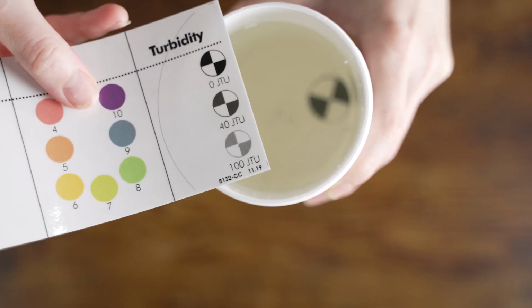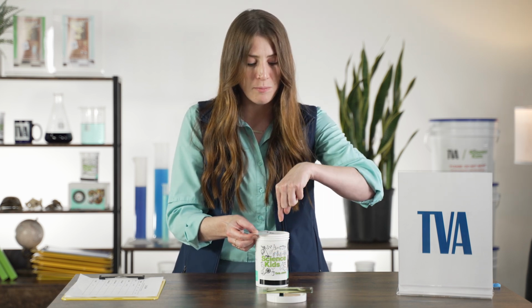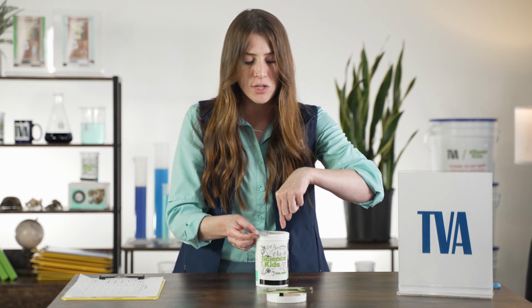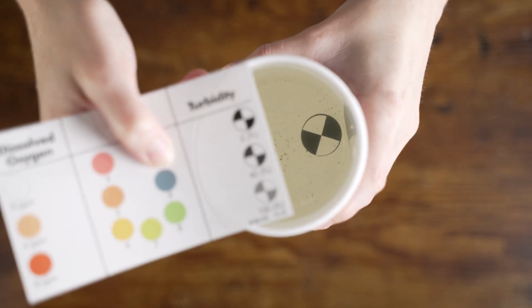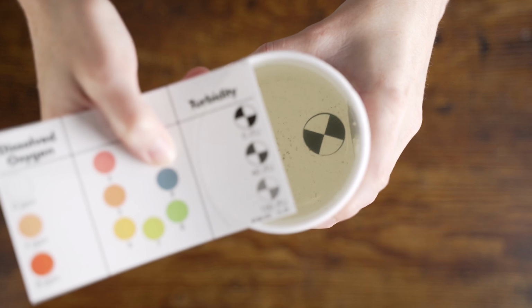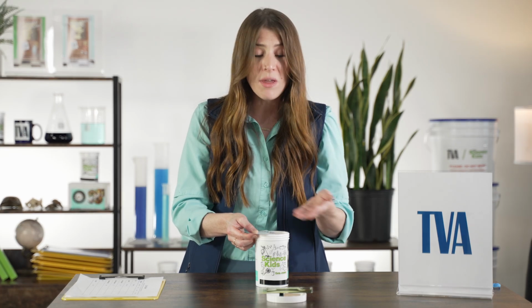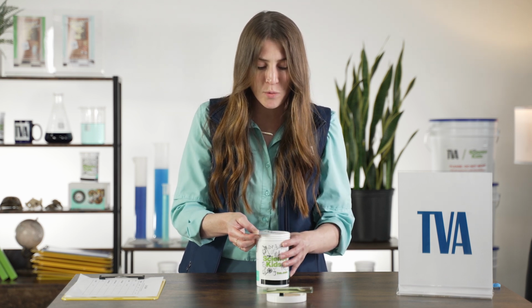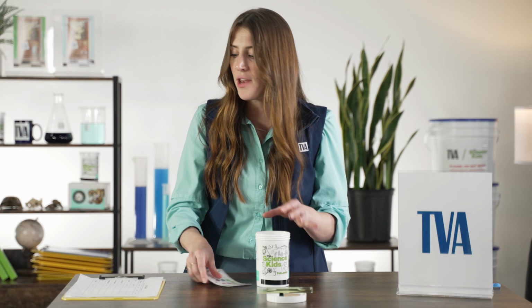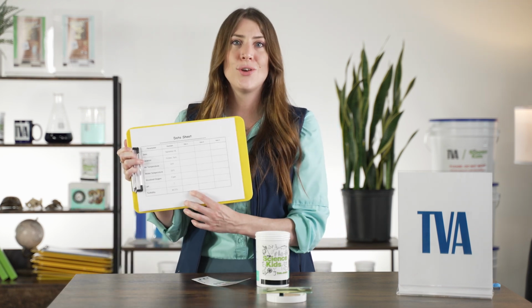You're going to take your comparison card and line it up on the edge of your beaker. And you're going to look at the Secchi disc in your beaker and compare that color and that clarity to the Secchi disc on your comparison card. Which one of these most resembles the Secchi disc in your beaker? Is it closer to 0, 40, or 100 JTU? Or maybe it's something in between. Look at your Secchi disc, determine what your JTU is, and then you're going to record it on your data sheet on your turbidity section using your units of measurement.